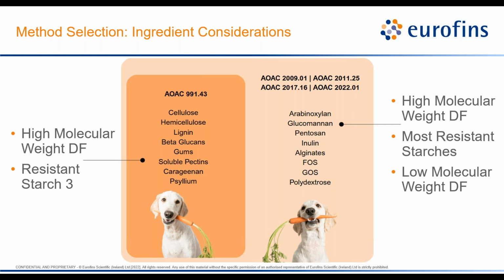That's a great question. The main requirement is to ensure that products are labeled as accurately as possible for dietary fiber. If the lab you work with is utilizing a different method, the main thing is to understand what that specific method is actually quantifying and where there could be potential downfalls when it comes to your particular formulation. Dietary fiber should absolutely not be confused with crude fiber. If you approach a laboratory and just say, I just need fiber analysis, crude fiber is a really common request. So if they don't ask, it's very possible you might get a quote for crude fiber or they might apply crude fiber. So be very intentional when you approach your laboratory and say, I need dietary fiber. And then if you want additional discussion around the other methods, that would be a good time to do so.